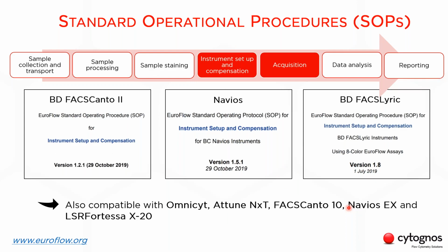There are also protocols for instrument setup, calibration, and compensation available for different instruments. And these protocols cover the instrument configuration, that is, the setup of forward and side scatter, the setup of the photomultiplier voltages, the compensation settings, and of course, the instrument performance monitoring.